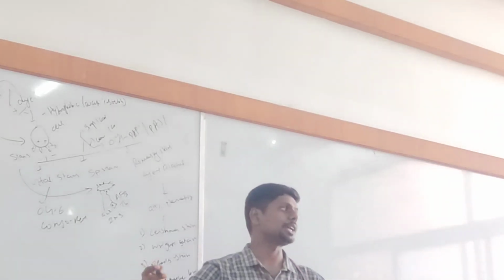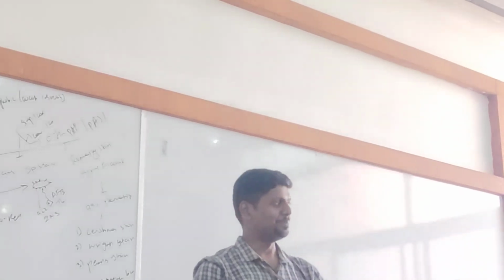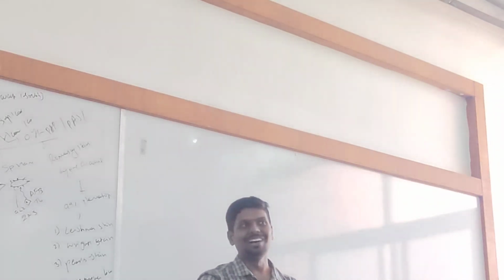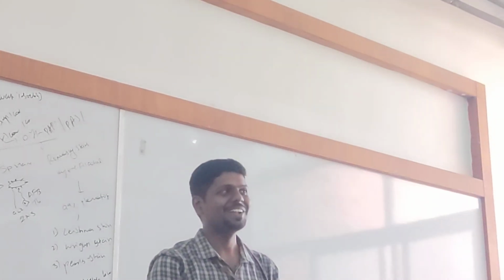You are saying negative stain and positive staining. Now you are again going with classification. Let us keep this concept aside because stains classification is really a very big topic. Okay. Positive and negative. We got a point here.